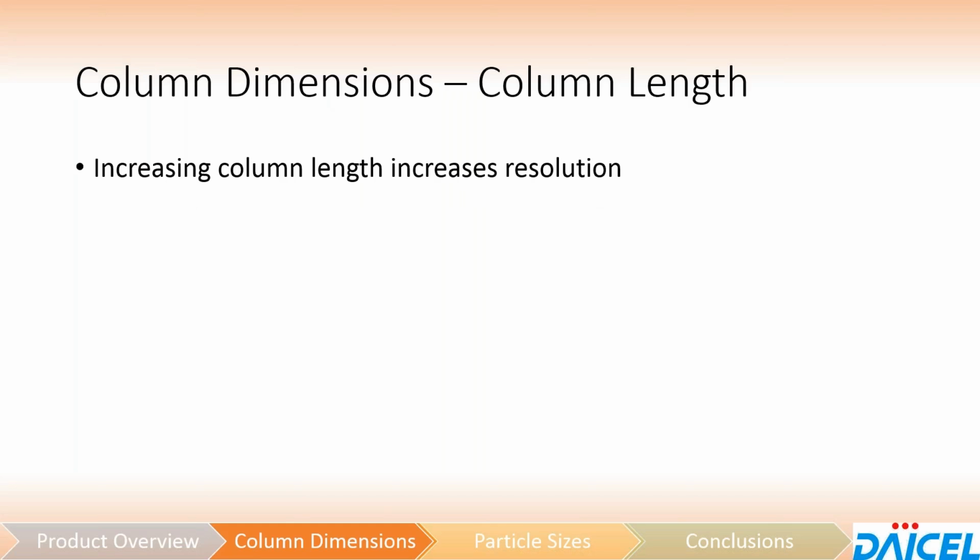All right, so if we move into our section on the discussions of column dimensions and things that you can expect to see when you begin changing column length, for instance, the obvious change that you're going to see in increasing the column length is an increase in resolution. I think most of us are probably very familiar with that.